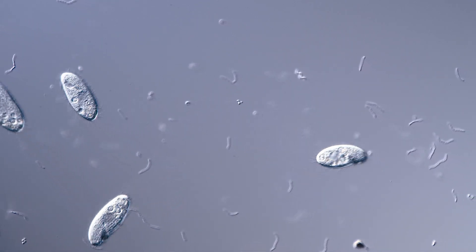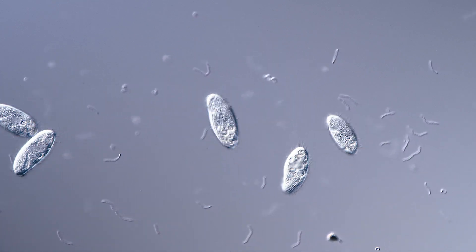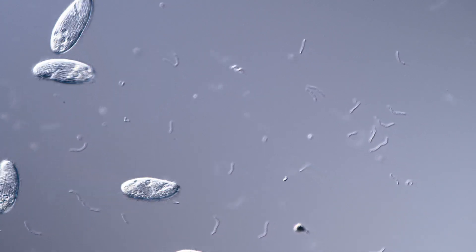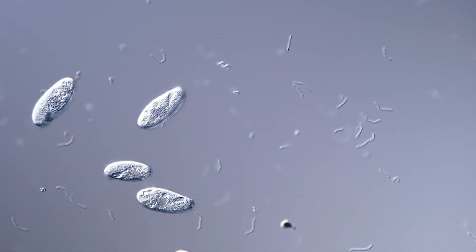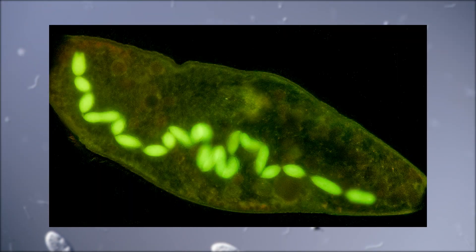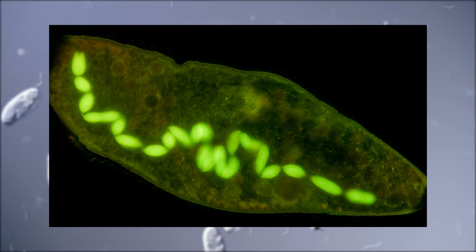Fluorescent microscopy can be used for pond life observation. It's especially useful for staining ciliates as it can help to identify certain species, allows the observation of food vacuoles, and you can also stain the DNA. Here's a quick example of a ciliate from the genus Spyrostomum that I have stained with an acridine orange dye and observed with an epifluorescent microscope. You can clearly see the strong green color of the stained DNA — this is the macronucleus, which is responsible for all non-reproductive cell functions.